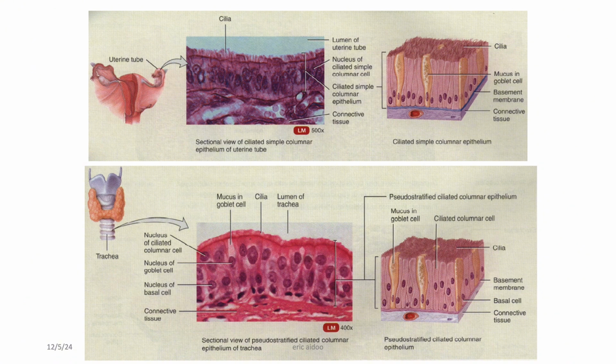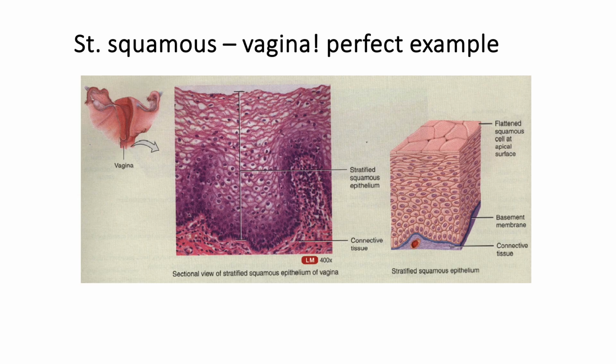You can also find that you have apical specialization there. Usually in the reproductive system of the female, especially the fallopian tube, you find the upper part of the epithelium there, and then the lower part of the picture here relates to the respiratory areas.